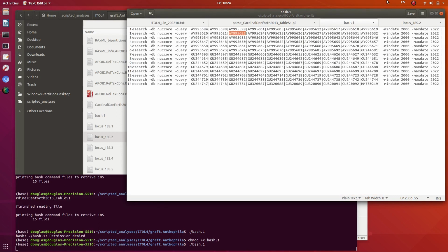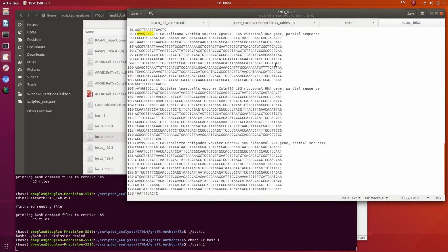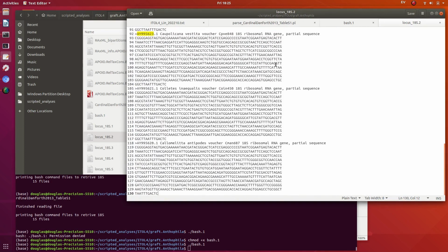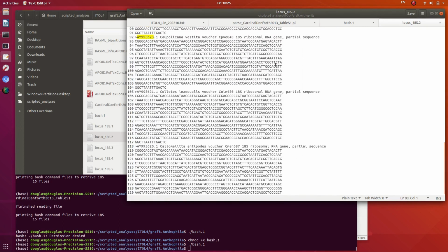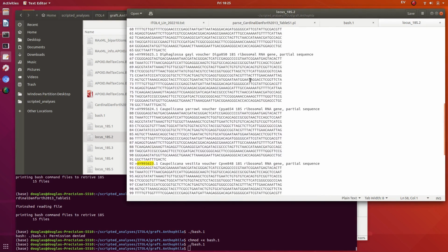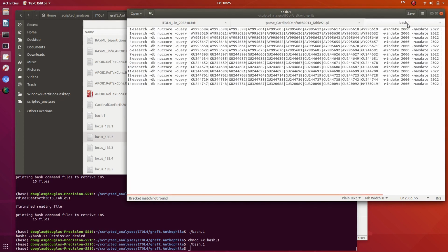Let's just check. The third one is, okay, the order is unexpected, but it is there. Okay, I don't see a problem here.